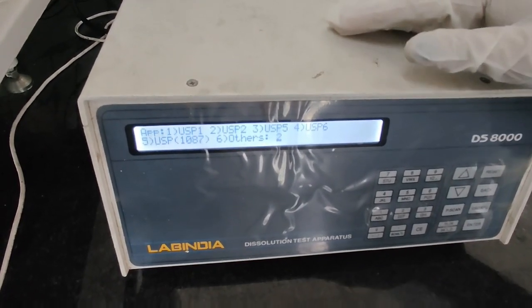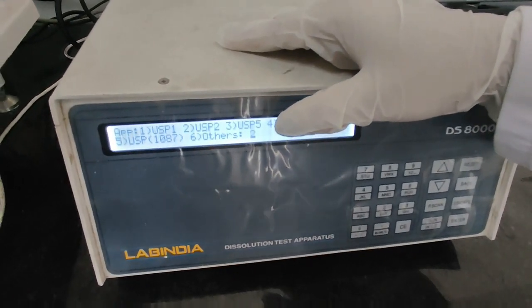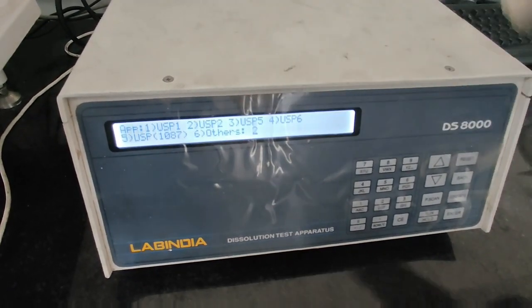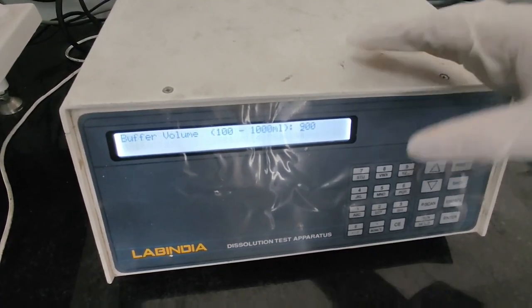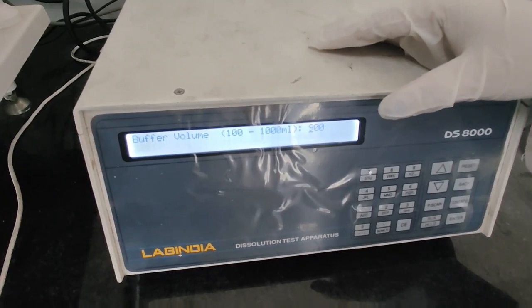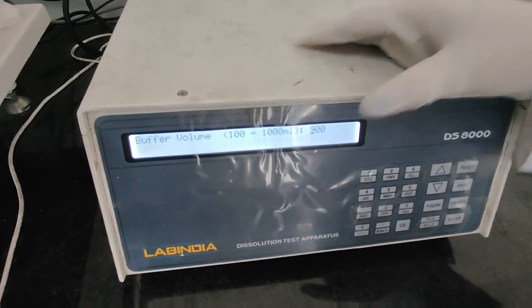Again press enter. As we are using USP apparatus 2, that is paddle type apparatus, already 2 is written. If you want to use basket, you may press 1. Now I will press enter. Then about the volume, I want 900 ml. It is already there. If you want to change it, you can change it from here.